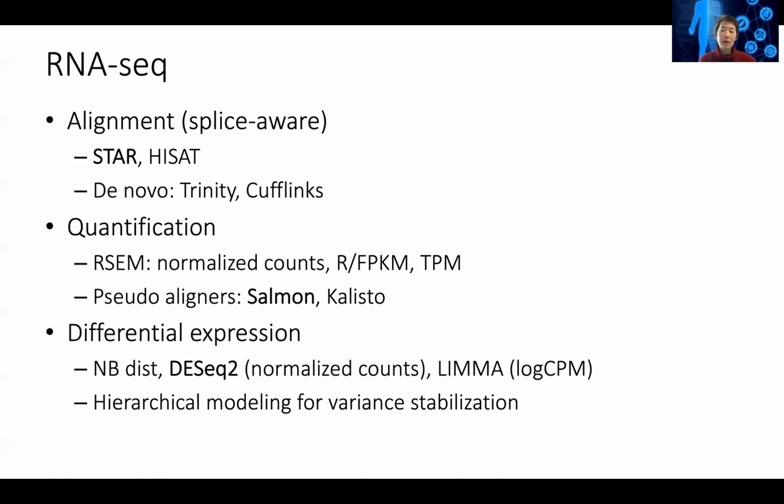So this is only normalized by library size, or the FPKM or RPKM, which also normalizes by the gene length, or you can normalize by TPM.